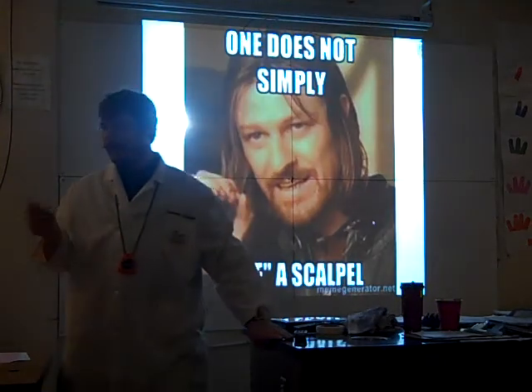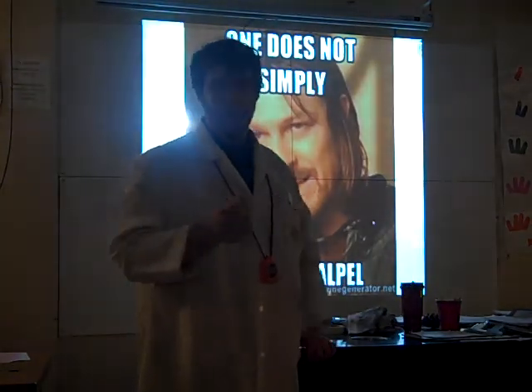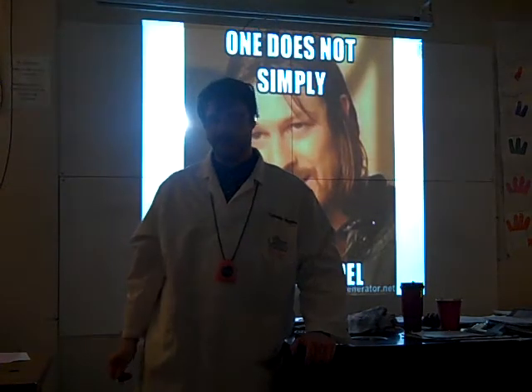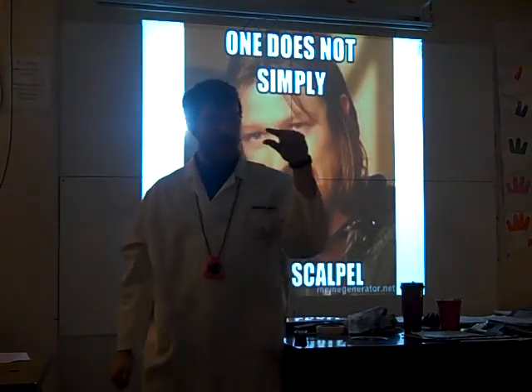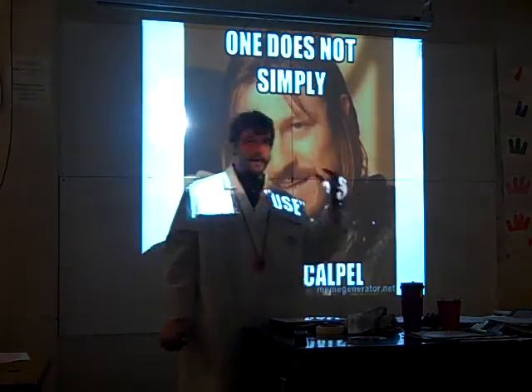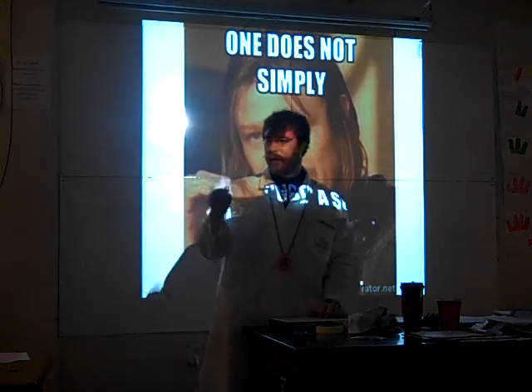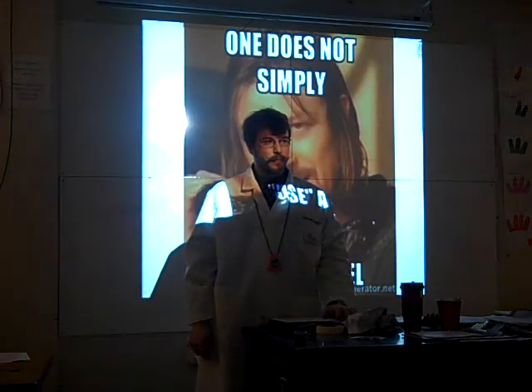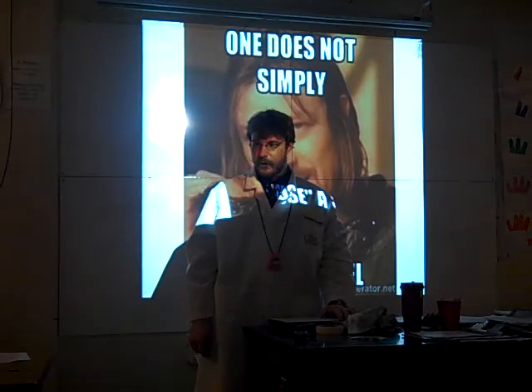The scalpel blades are preposterously sharp. You know how I know they're sharp? Everybody always says that, but no, I've never cut myself with a scalpel yet. The package that the blades came in said surgical scalpel blade on it. These are literally the same blades that surgeons would use to cut you open. They're brand new. I just put them on yesterday after school. Didn't cut myself. It's dangerous.